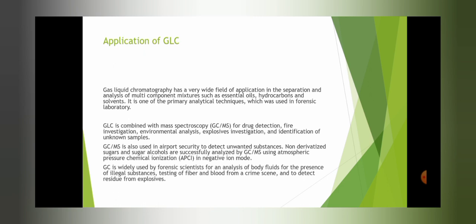We have the applications of the GC. Basically, GC has many applications, but for our case, we're going to discuss three applications. Gas liquid chromatography has a very wide field of application in the separation and analysis of multi-component mixtures such as essential oils, hydrocarbons, and solvents. It is one of the primary analytical techniques used in forensic laboratories. Our first application is GC combined with mass spectroscopy for drug detection, fire investigation, environmental analysis, explosives investigation, and identification of unknown samples. So that is the first application of the GC.